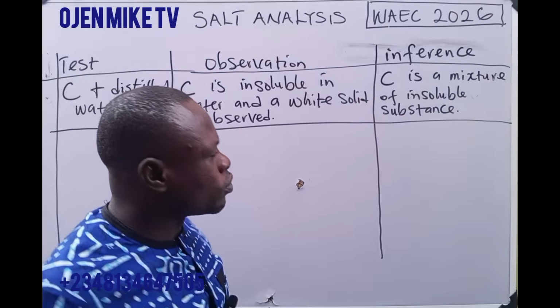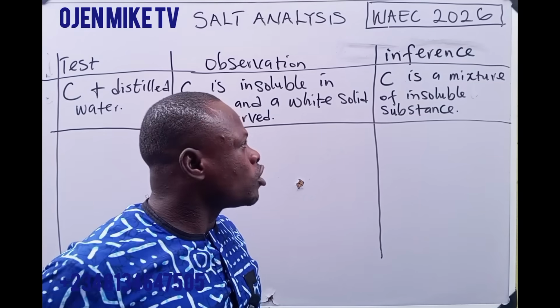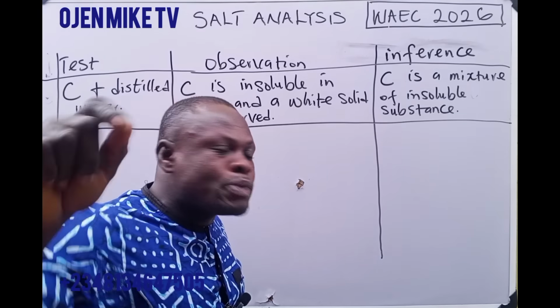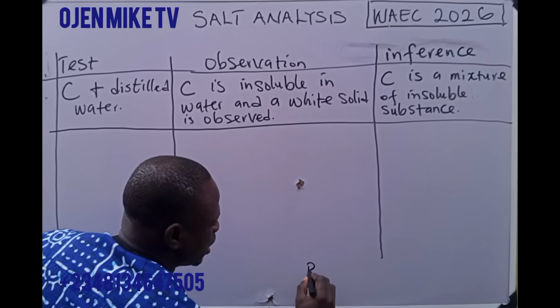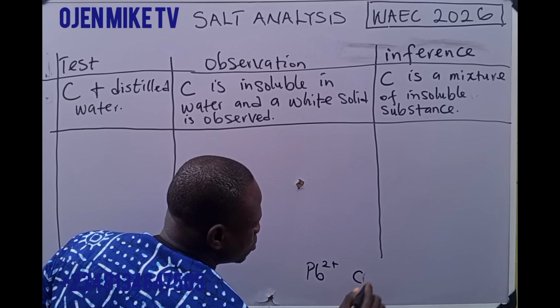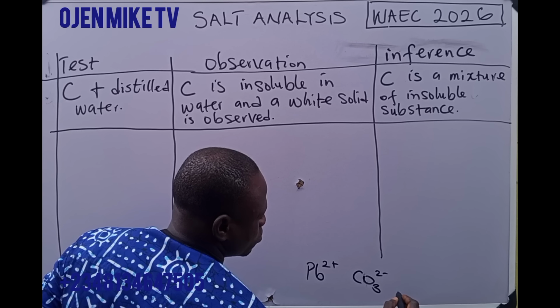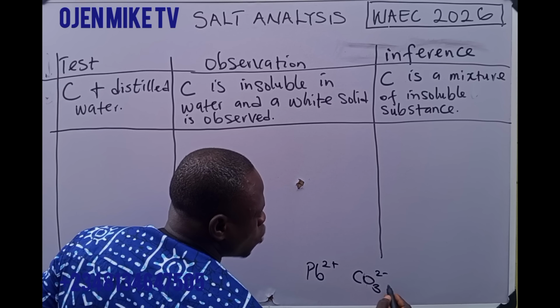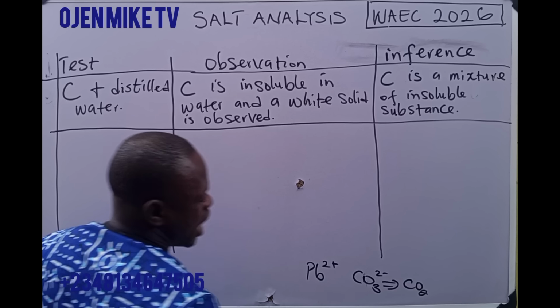Now the next thing is what? Since it is an insoluble substance, what can you use it to test? Remember, the ions we are expected to test are lead 2 ion and carbonate ion, which will give rise to CO2, and what do we have?